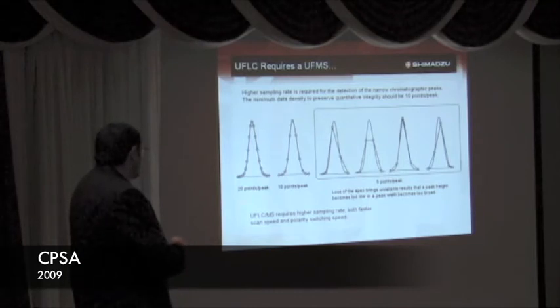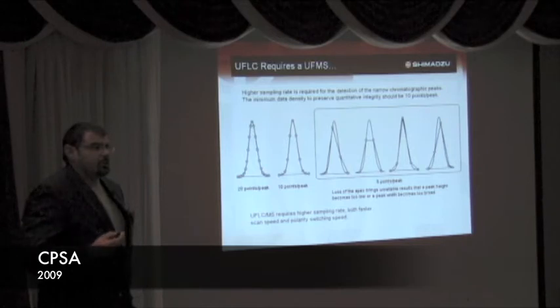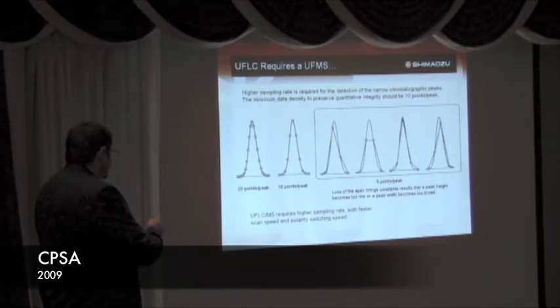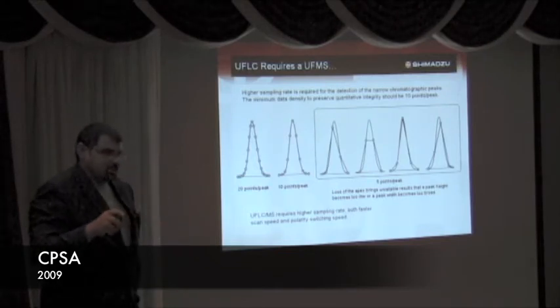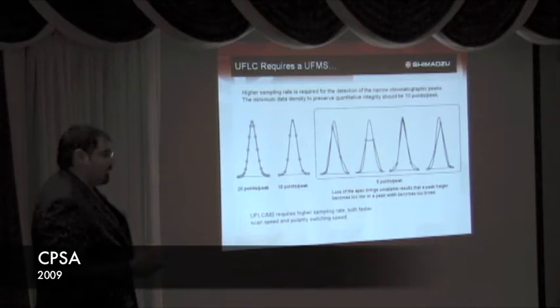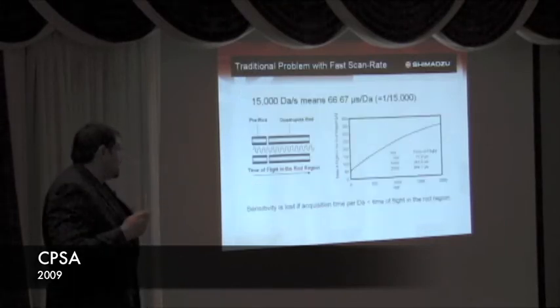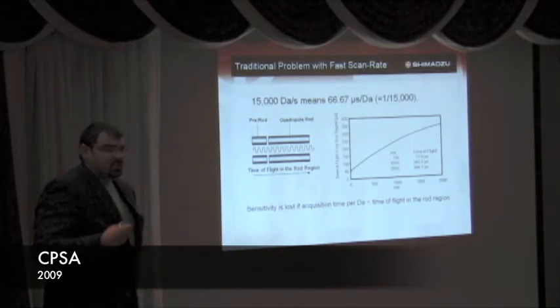To get good quantitative data, we estimate somewhere between 10 and 20 points to define a total ion chromatograph peak is required. If you get less than that, you start having trouble defining the peak and the peak shape, and as we all know, TIC is not as uniformly distributed as something like a UV. It's a point-to-point connection. So we need that higher scan speed to be able to get those peaks and create the quality that we need. One of the things you think about when you think about increasing speed, one of the nasty side effects that comes with it is a loss of sensitivity.